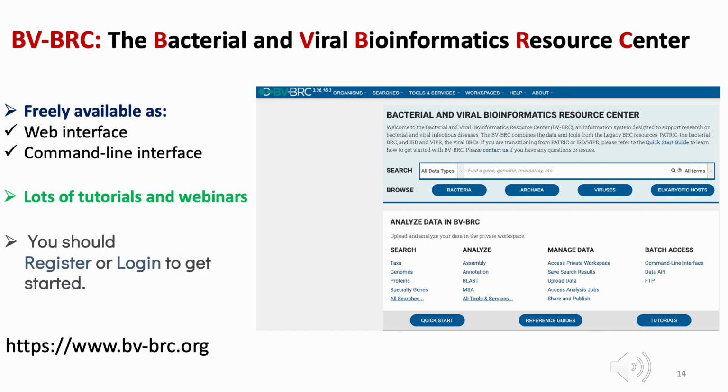So to overcome this issue, I'm going to introduce you to the BVBRC, or the Bacterial and Viral Bioinformatics Resource Center. That is an information system designed to support research on bacterial and viral infectious diseases. BVBRC combines two long-running bioinformatics resource centers, the Patric, or the bacterial system, and the IRD ViPR, the viral system.